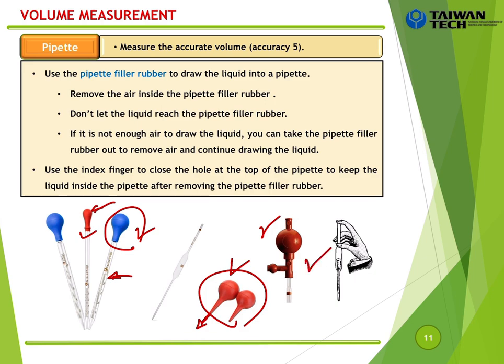So what's the convenience here? You can see this one you connect to the pipette, and this one is only air, this one is only air. So you should connect this pipette filler to the pipette this way.